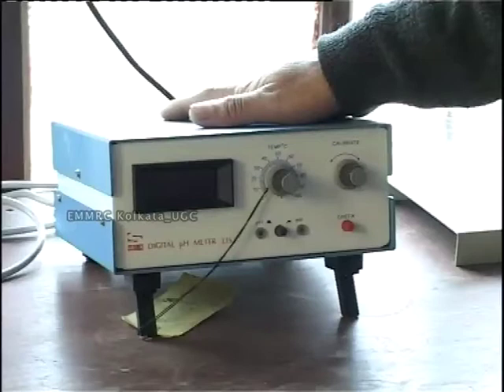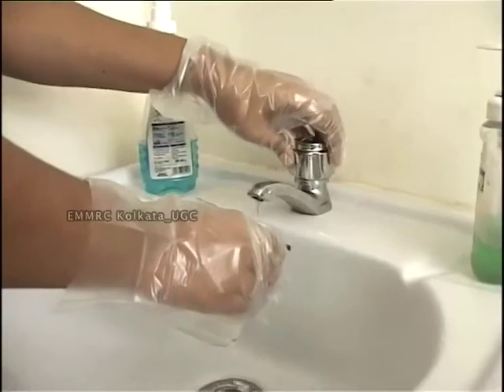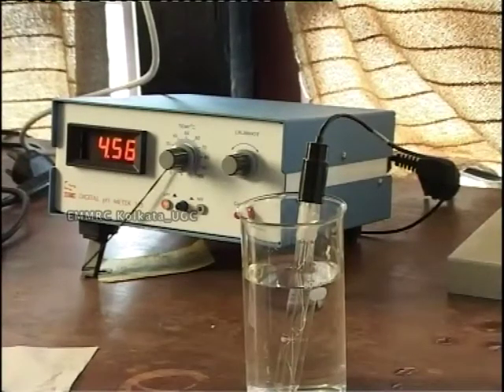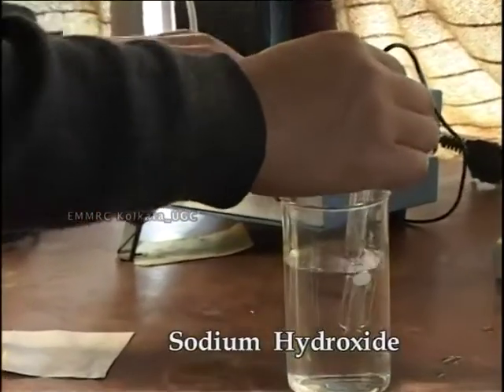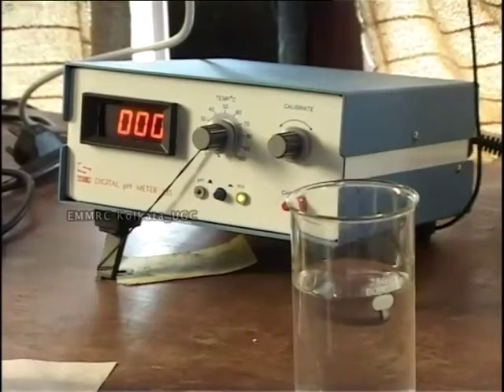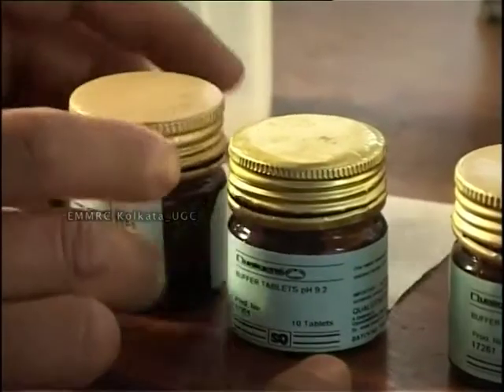This is a pH meter. Let's analyze this water. Its pH is 4.56. It is acidic. To increase this pH level, sodium hydroxide is added and stirred. Now the pH is 7. Nowadays, pH tablets are available in the market.